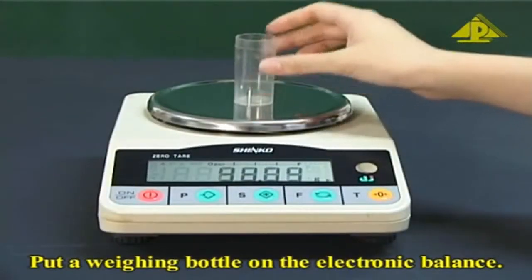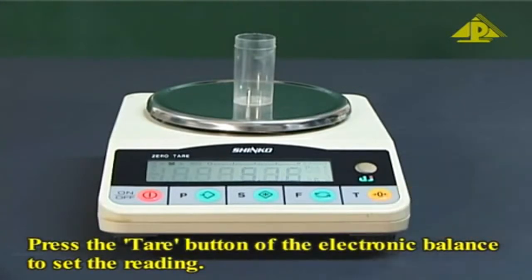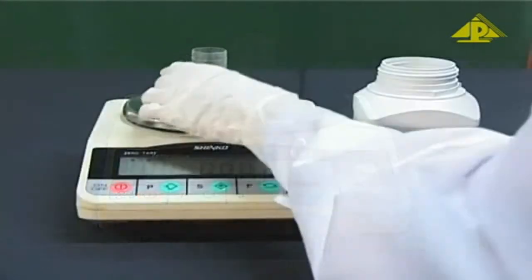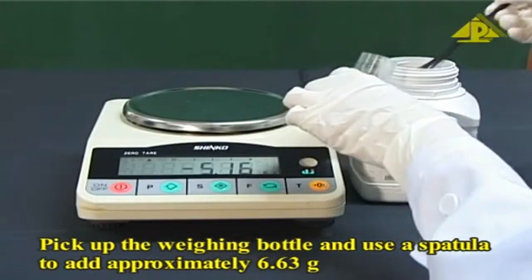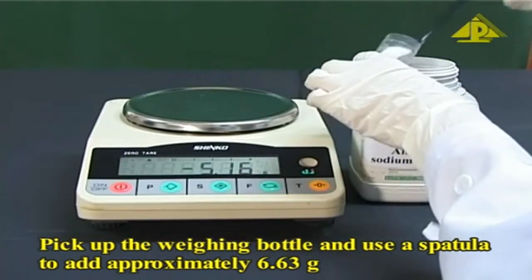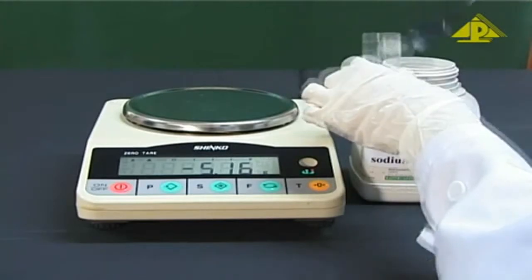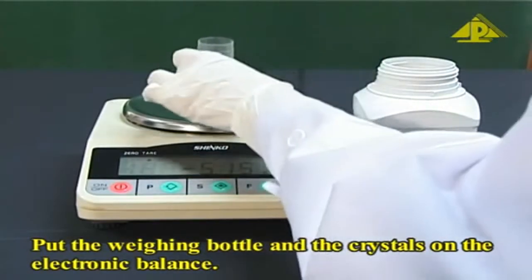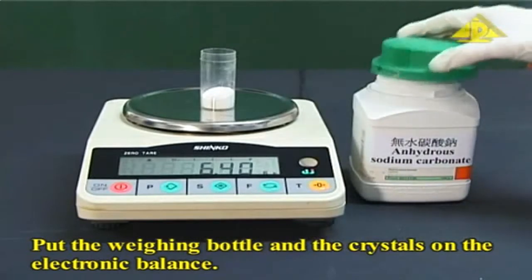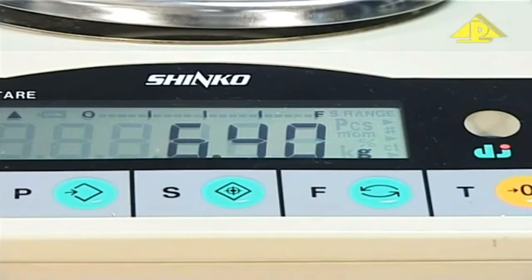Put a weighing bottle on the electronic balance. Press the tare button of the electronic balance to set the reading. Pick up the weighing bottle and use a spatula to add approximately 6.63 grams of anhydrous sodium carbonate crystals to it. Put the weighing bottle and the crystals on the electronic balance. Take the reading of the balance.